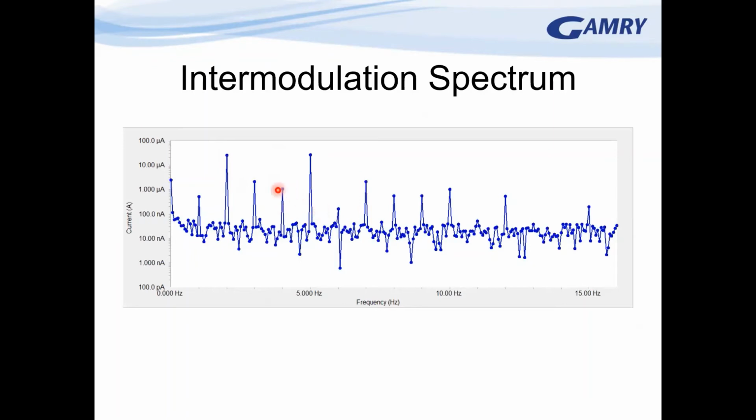And this one and this one are the same size. And then this one, and this one. And then these two here. And you can also see, as I pointed out, that there are missing responses at the points where we would expect not to see any response.